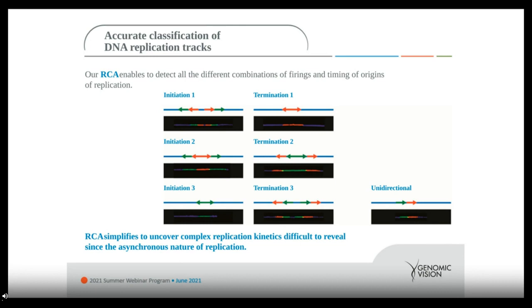So these are three different kinds of initiations, but with combing, we can also see termination. Termination is shown as a flipped color compared to the initiations because we consider that the bubbles are going to fuse together when the replication reaches the end. For termination 1, we see only red tracks. In this case, we consider that the green tracks have fused together, so the replication has been resolved for the second pulse. Now we only see the first one, that is the red.